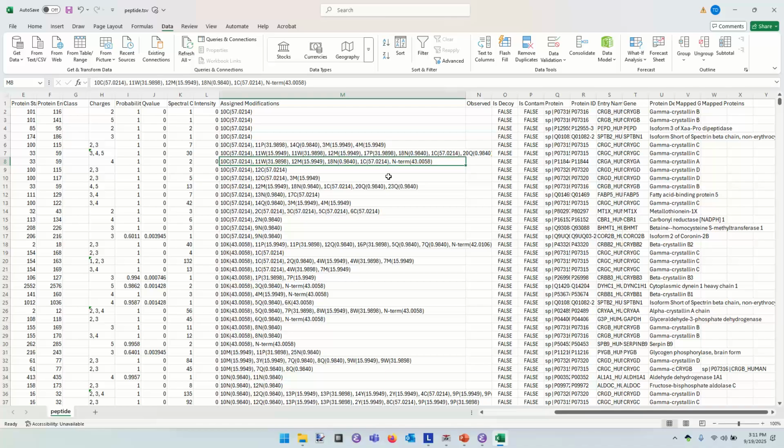But we still have one dioxidation, one oxidation, one deamidation, and one carbamylation. So why did the software produce those? Software gets a little hinky when you start working with PTMs like this. So I'm mystified as to why the limit of 3 was not applied here.